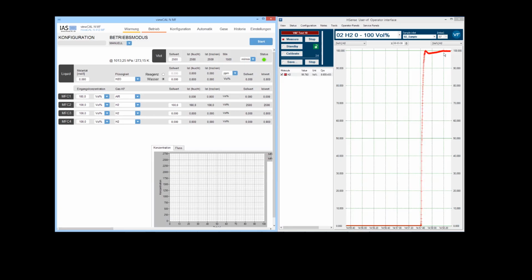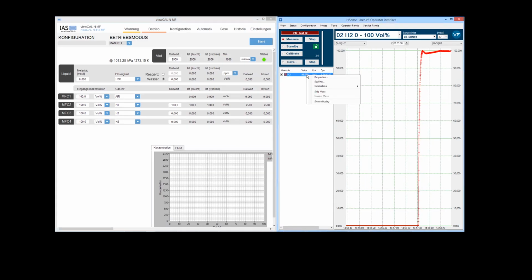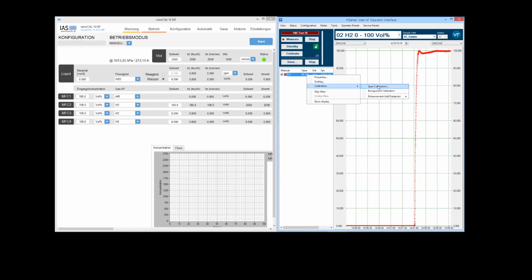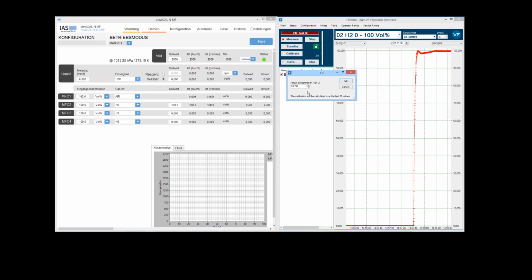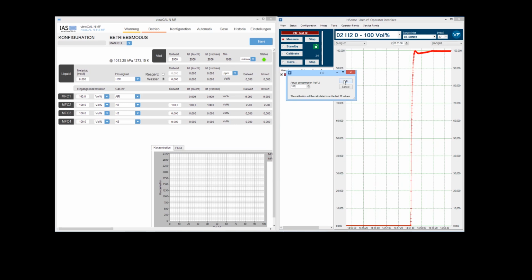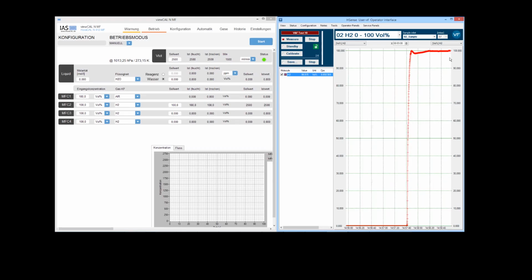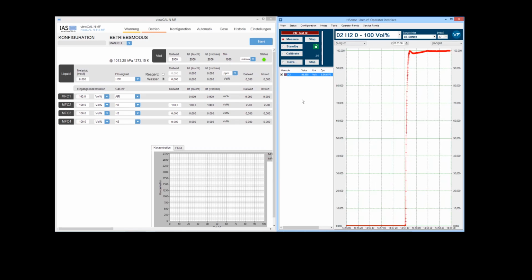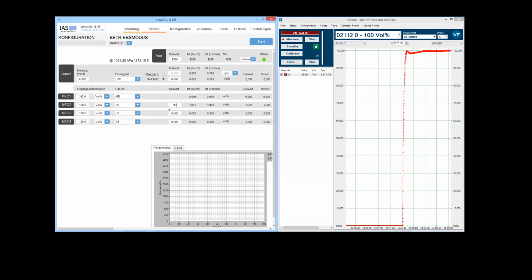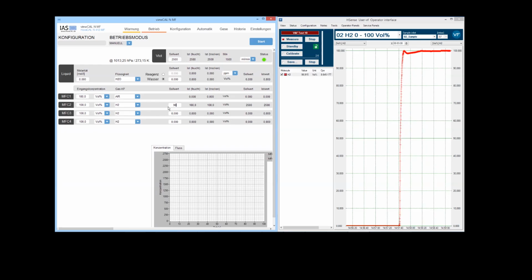So once we see that we get stable results with time, what we can do is, again, right click, go to calibration, then we will select span calibration and enter the current concentration, which is 100%. This will again take effect immediately. So now we have established a 2-point calibration. What we're going to do now is use the gas divider in order to produce the other concentrations which were in the list in the presentation, starting with 90.